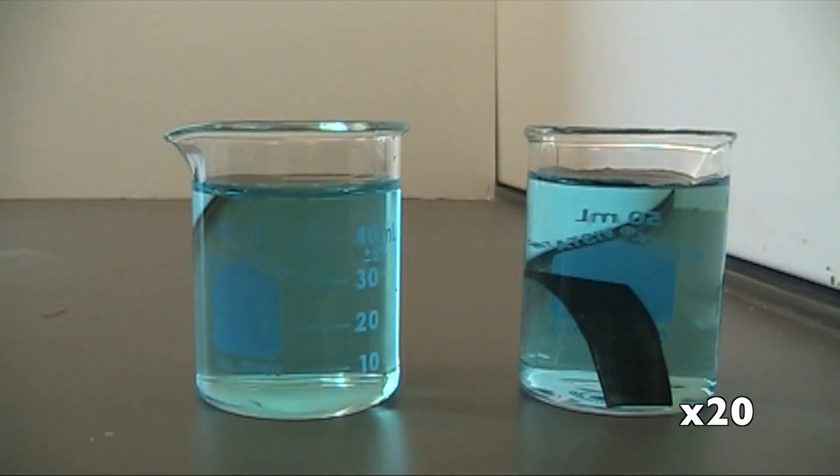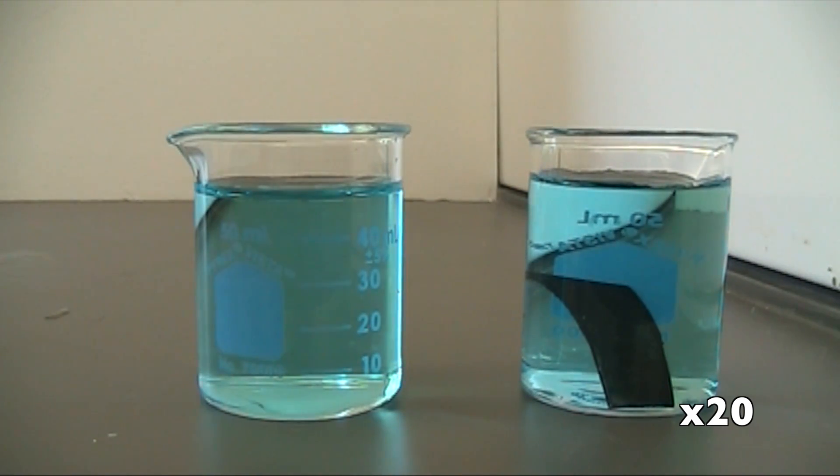For this experiment we prepared 50 milliliters of 0.1 molar copper sulfate and a strip of zinc metal. Two solutions of copper sulfate were made, one as the control, the other as the experimental, to observe any differences to the solutions after zinc was added.